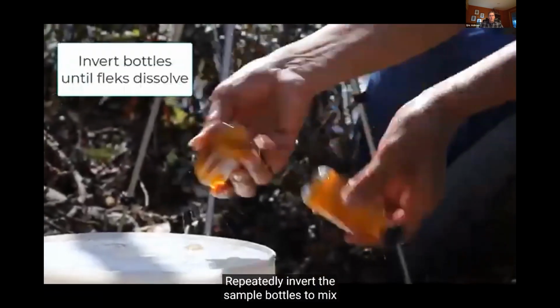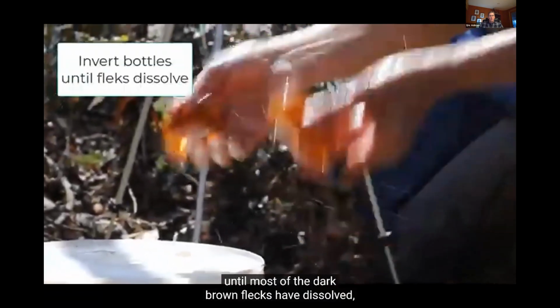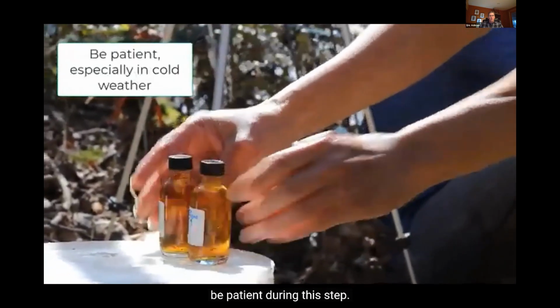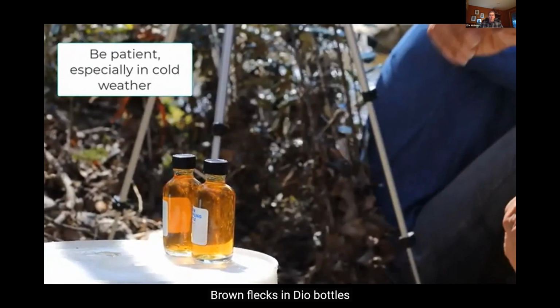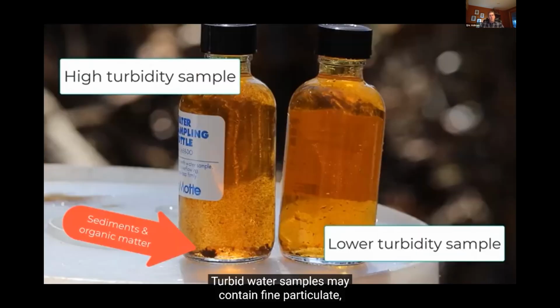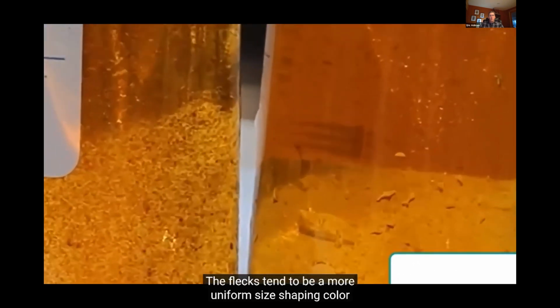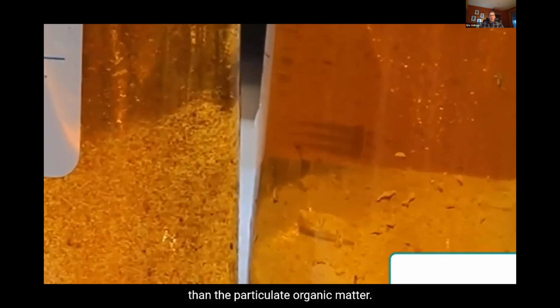Repeatedly invert the sample bottles to mix until most of the dark brown flecks have dissolved. Be patient during this step. Brown flecks in DO bottles may take several minutes to dissolve, especially in cold water. Turbid water samples may contain fine particulate organic matter that may not completely dissolve. The flecks tend to be a more uniform size, shape, and color than the particulate organic matter.